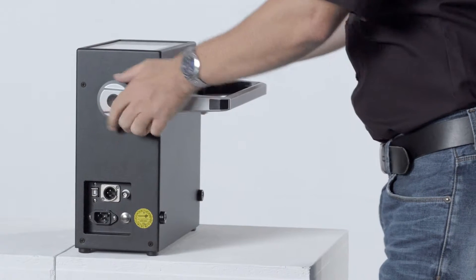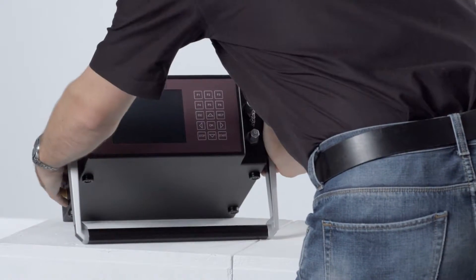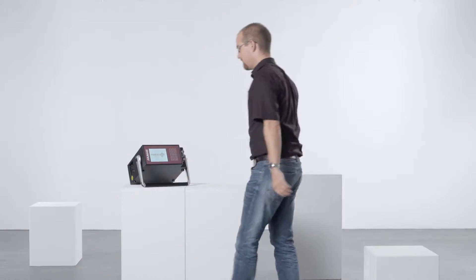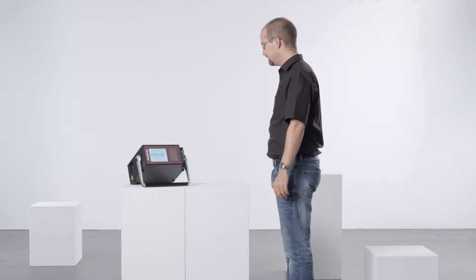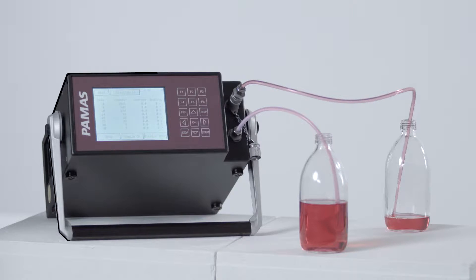The PAMAS S40 has been specifically designed to be a portable unit incorporating a carry handle and lightweight robust casing that enables the analysis of samples anywhere in an array of environments.